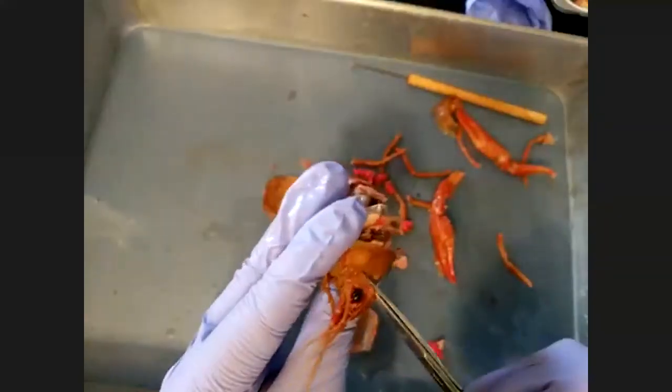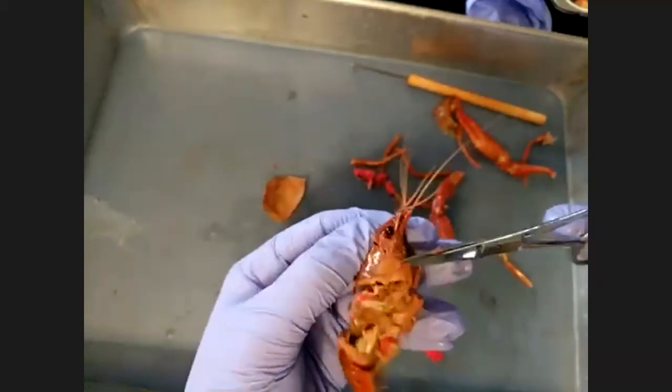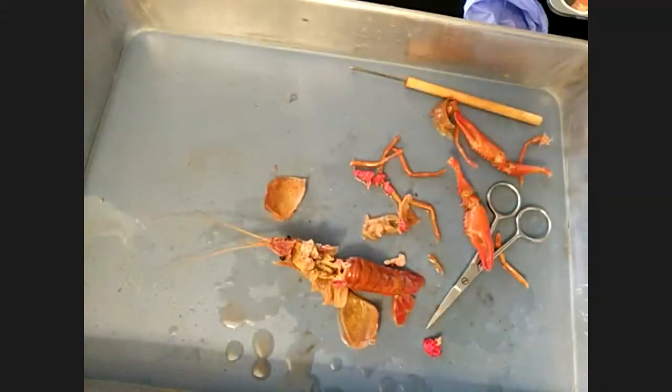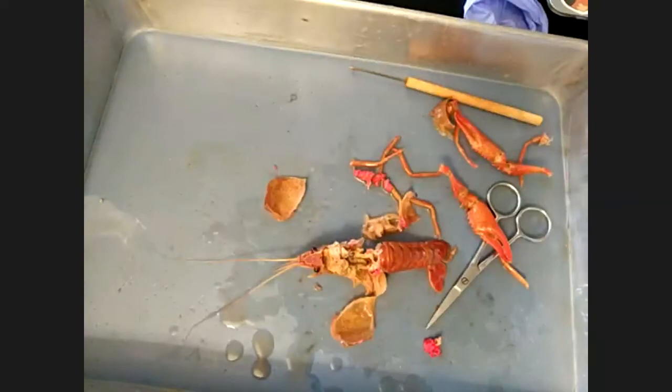All right, so a crawfish actually has two stomachs. You might want to write this down. One stomach is called a cardiac stomach. The cardiac stomach is used to store food. They got one stomach just for food storage. And then they have a second stomach called a pyloric stomach. You spell pyloric, P-Y-L-O-R-I-C, pyloric. And that one's used to digest. So we got one stomach just to store food, and then one stomach to digest food.